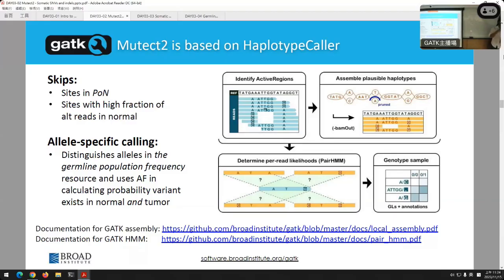I have not gone into the code for that part, but that's part of the reason, I believe, why we try to group by allele frequency as opposed to just making assumptions of ploidy and what that would look like. The fact that we might have a lot of different alleles that show up at different rates in our cancer cells meant we had to change that part so it didn't break HaplotypeCaller. So we can account for alleles showing up at different frequencies that might not be 50-50. We didn't want to assume. Also, remember Eric mentioned we might have a lot of different copies there. So that's why we had to change that part. I'm not sure if that 100% answered your question, but that change was meant to account for the fact that alleles show up at different rates.